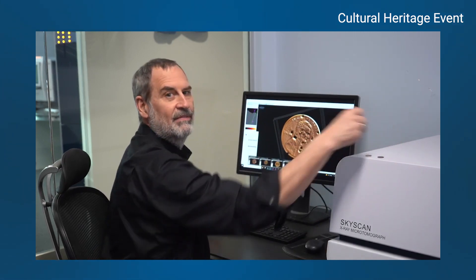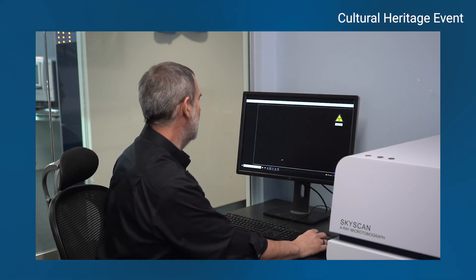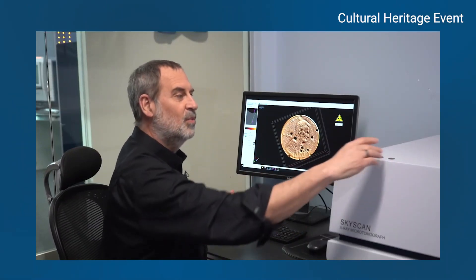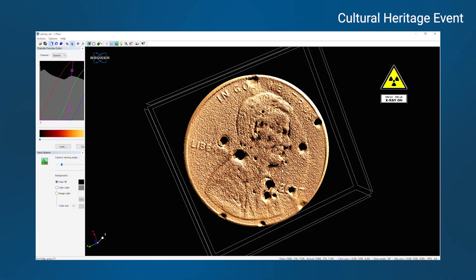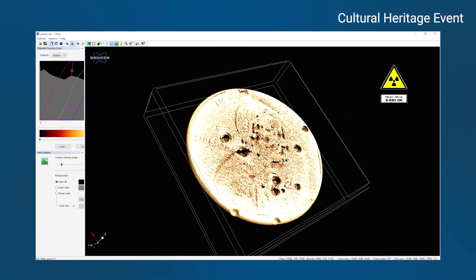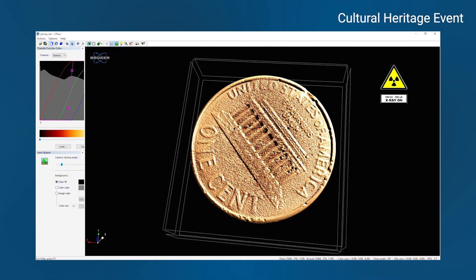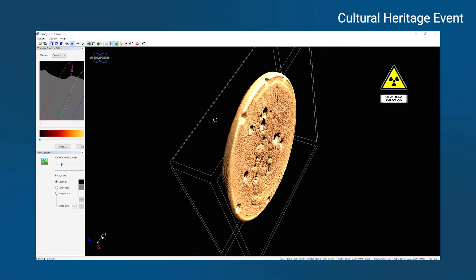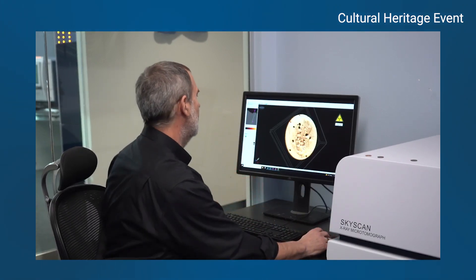The third penny is heavily tarnished — really dark brown — with some pitting and some white material on the surface. When I bring it up you can actually see massive holes in this penny that you don't see with the naked eye. I've got huge pits, and you can actually see down to the bottom inside them. Flipping it around 180 degrees to the back side, it looks pretty good with only a little bit of pitting. So we can say we have surface damage that doesn't go all the way through — useful for failure analysis work.